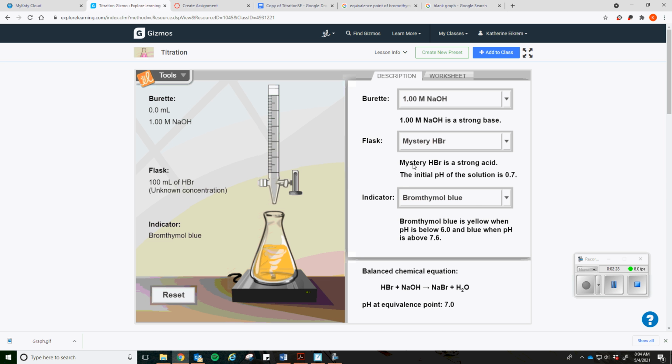When you are actually doing your titration, I'm going to go ahead and just go to phenolphthalein here to give you an idea. When you're adding it, this right here is your stopcock. When it's at the bottom, it's closed. When it's up 1, it's going drop by drop, so 0.1 milliliters at a time, and you can see that going up right here. If you go up further, it goes much faster. So I would be careful using that as you get late into the titration when you're trying to be really careful. You can see it going in.